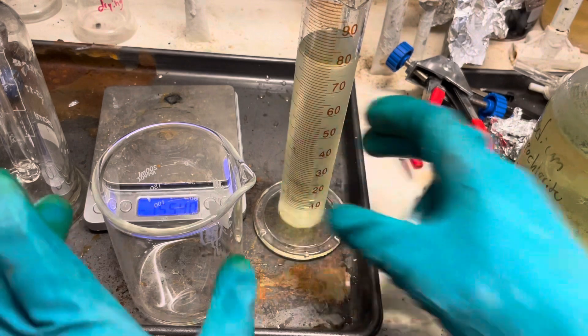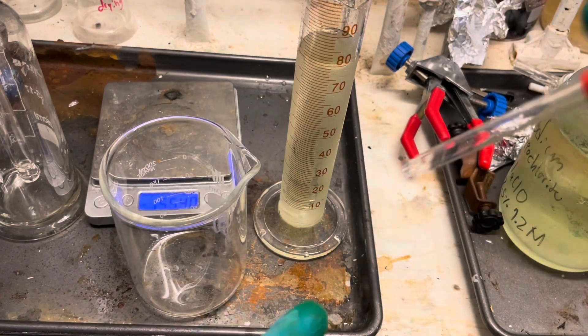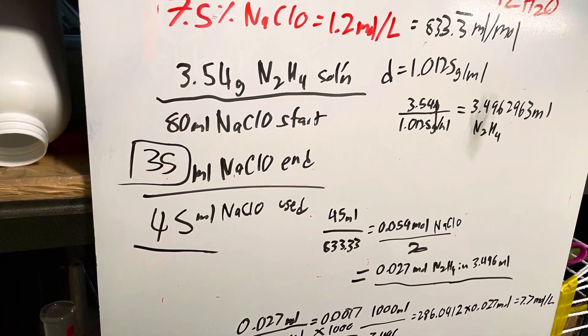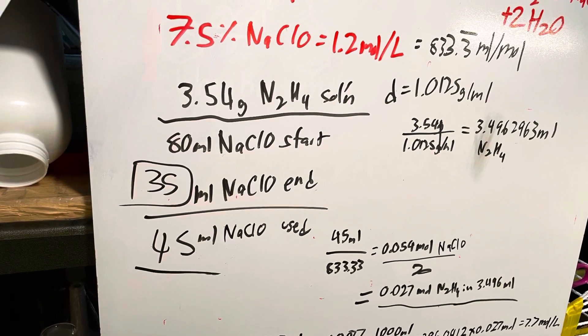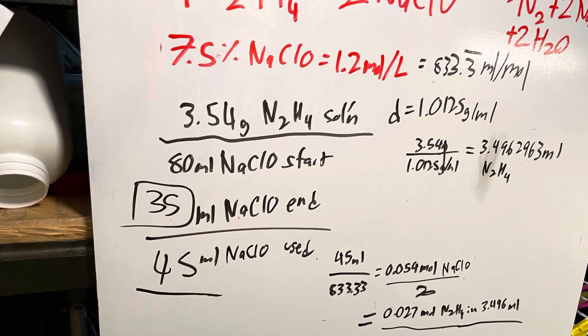I chose to use 80 milliliters of bleach and started adding our bleach to the hydrazine. I ended up using 45 milliliters of my sodium hypochlorite which is 7.5 percent, so it works out that our hydrazine is actually 24.3 percent.